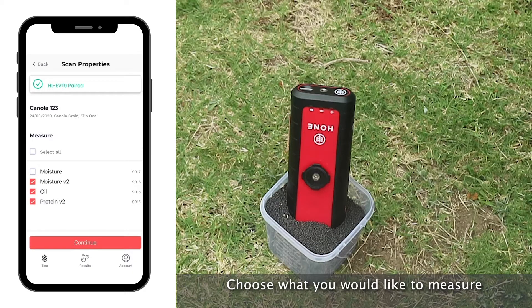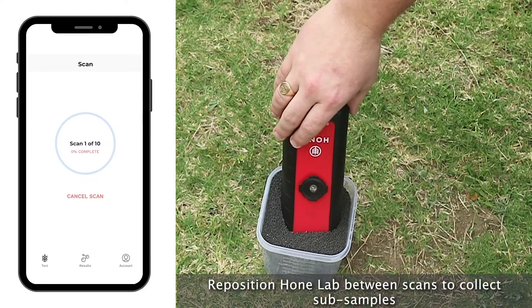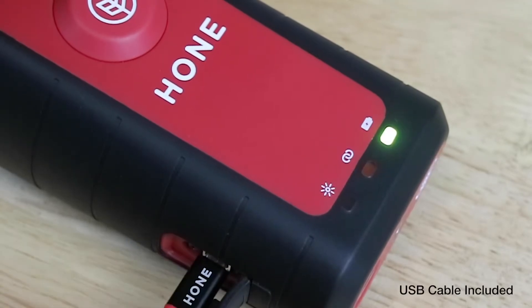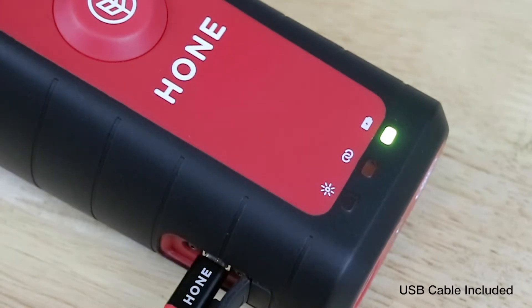The Hone Lab connects to a phone or tablet using Bluetooth. It's controlled with Hone's custom-built mobile app. The battery gives five hours of continuous use, but can easily be recharged with the USB.